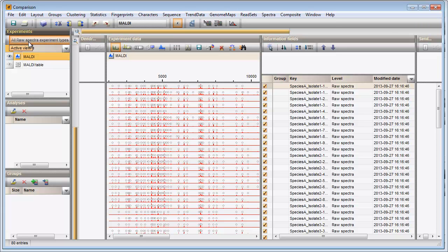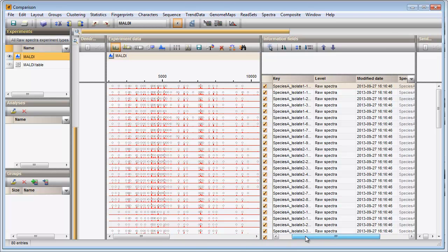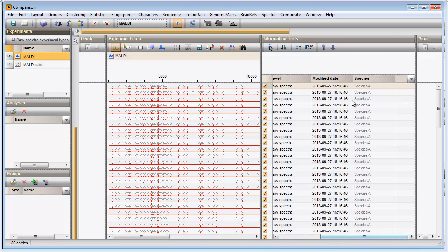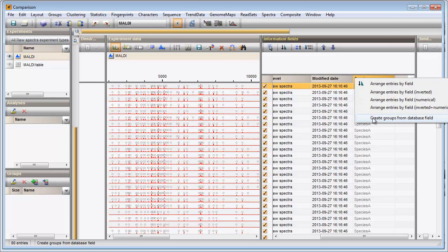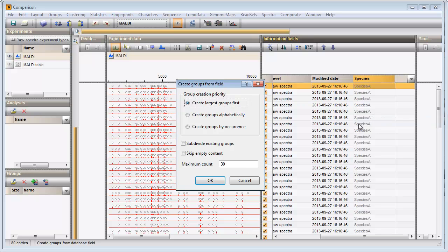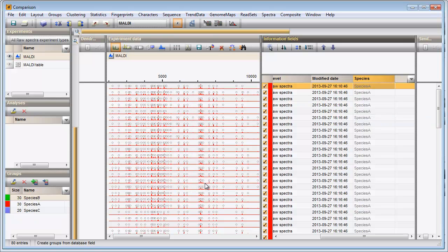For ease of interpretation I will create comparison groups based on the species names. I right-click on the Species column name, choose the last option and press OK. Three groups are created corresponding to the three species in my comparison.